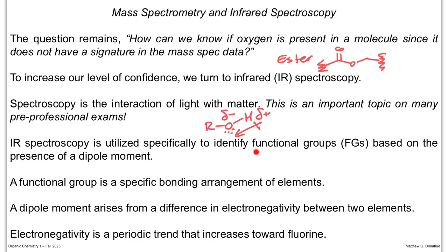So what the energy of the IR light will do is interact with that. You have a sample in an instrument, you're shining this light on it, and out the other end is a detector. I'm going to give you just the basics of that. We're not going to go too much into the math or anything. But the fact that the IR light does that and the instrument, quote unquote, sees it, allows us to see it and interpret it.